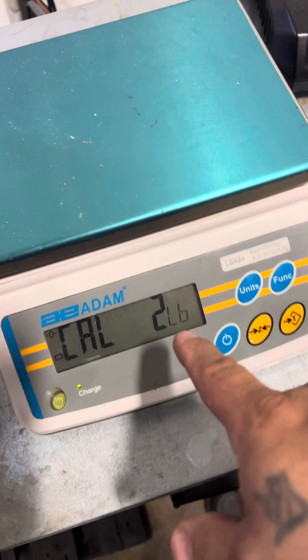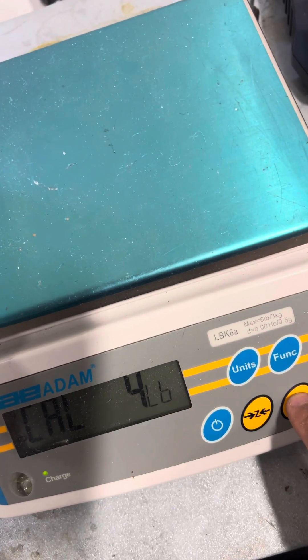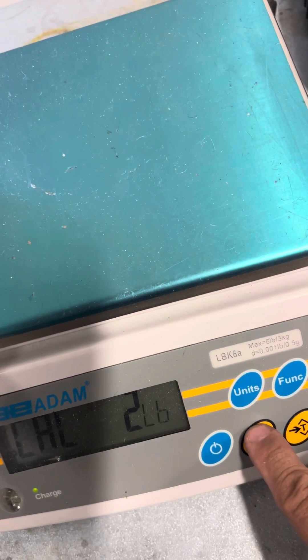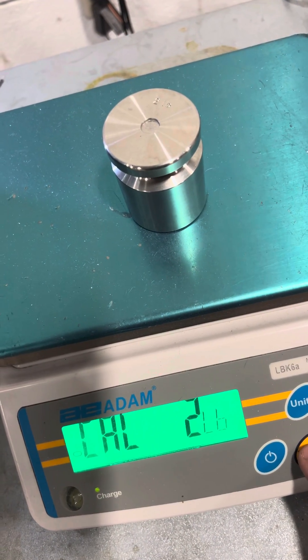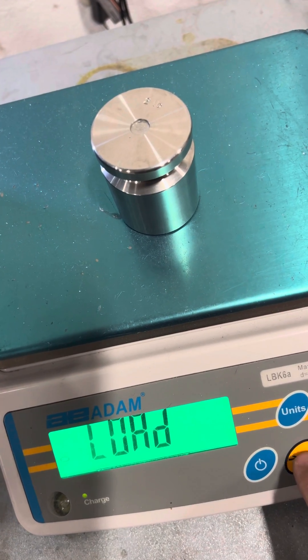Two pounds is what it asks for. If you want to change it, press the tear key to change it. We're going to use two pounds. Put the weight on, press zero. It says load, press zero.